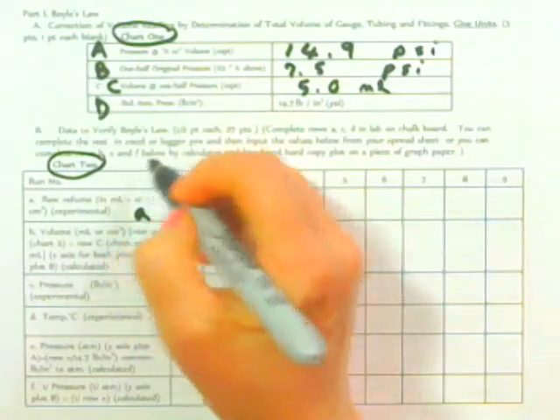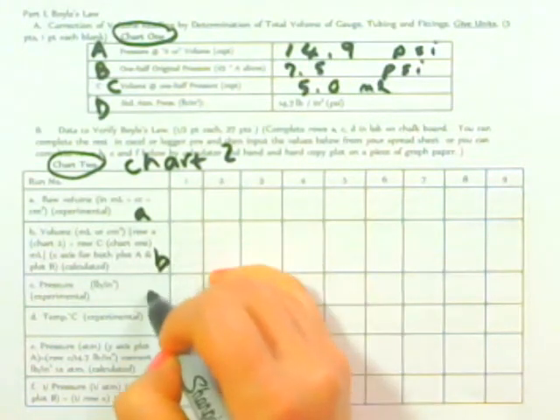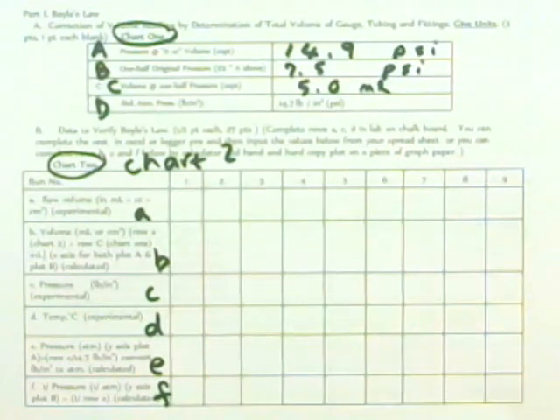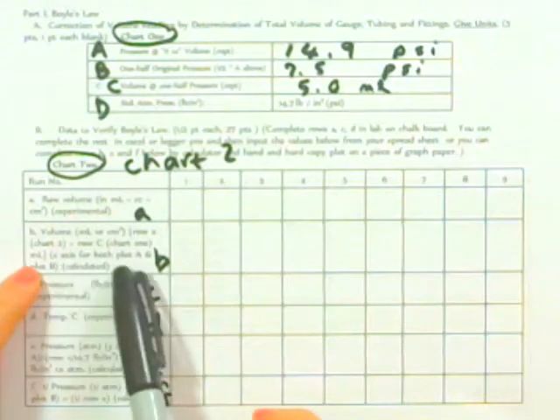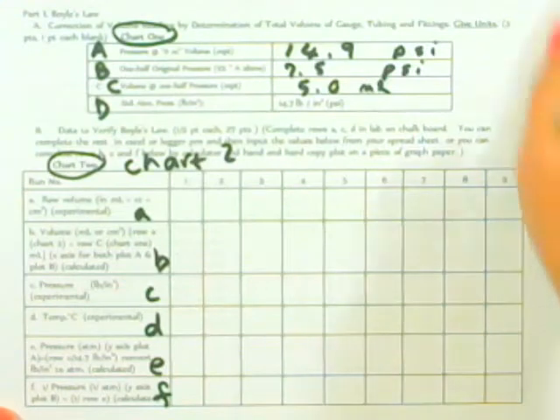Okay. So then what we're going to do is we're going to fill out the rest of this chart. So the rest of this chart is going to be from you looking at volume. So this first part right here, this is lowercase a. This is chart 2. This is lowercase a, lowercase b, lowercase c, lowercase d, lowercase e, and lowercase f. And my suggestion is that you actually read what it says here because it pretty much tells you what you need to do to get to the actual numbers that go into that part of the chart.